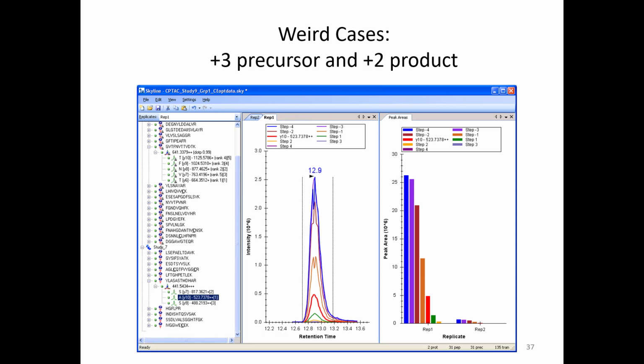There are cases, though, that are these precursors that are triply charged and their product ions are doubly charged. And because the regressions are based on the mass to charge of the precursor and the charge of the precursor, the collision energy is overestimated. So for doubly charged product ions, we often see this skewing where the best collision energy is many, many volts lower than what is predicted. And like I've talked to Brendan about, can those regression equations now be segmented based on charge of the precursor and charge of the product ion? But there needs to be enough data to generate a regression to support that.